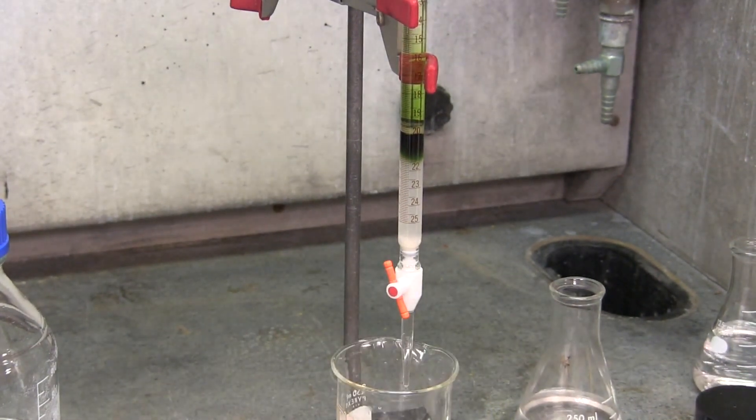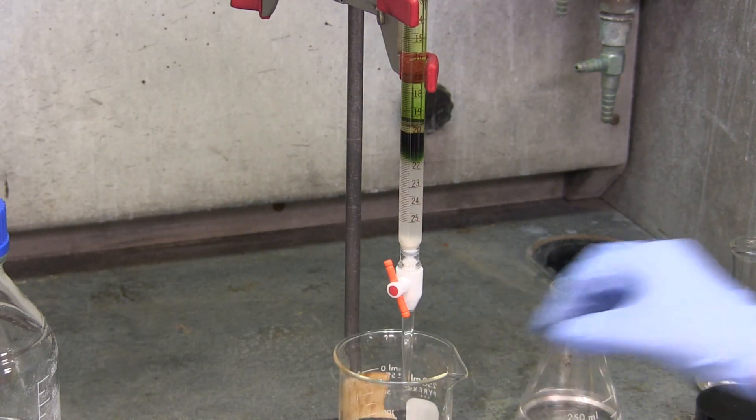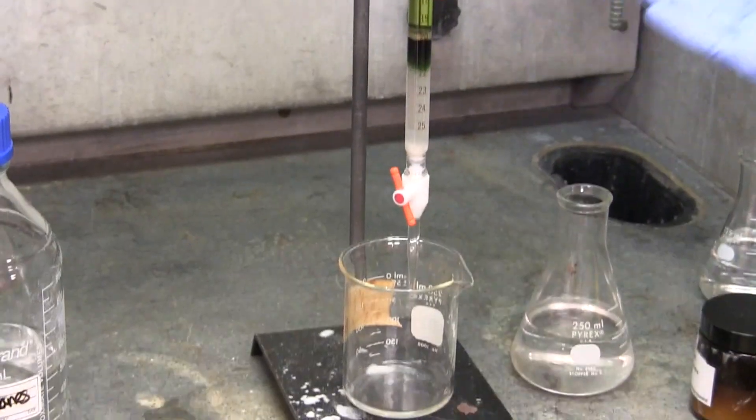As the column runs, make sure to add solvent in order to keep the column from drying out and cracking. The waste beaker can be kept under the burette until the first fraction is collected in a 25ml Erlenmeyer flask.